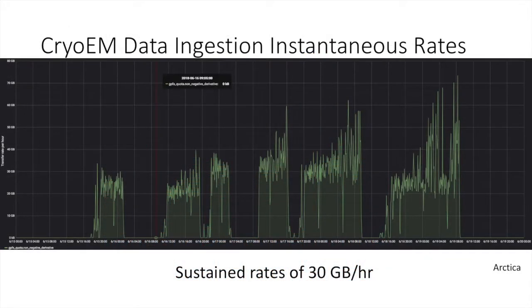But some other data that we've collected. We talked about slinging data around campus, or what the data rates coming off these instruments are. We instrument our machines in quite a detailed manner. Here I'm looking at some bit rates off of a network card. We collect this data every 10 seconds and keep it forever at full resolution, so it's really helpful for troubleshooting.